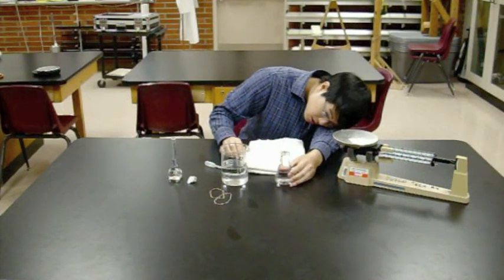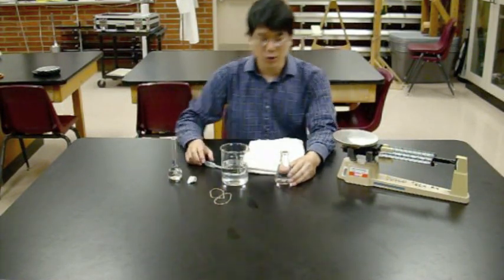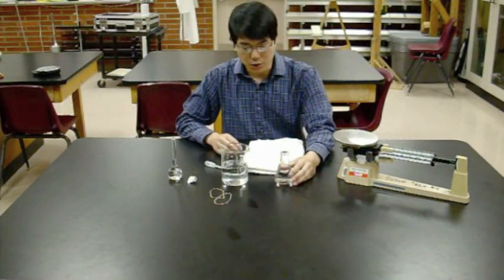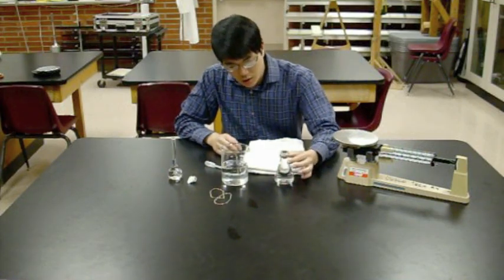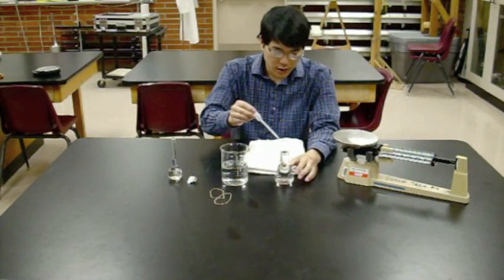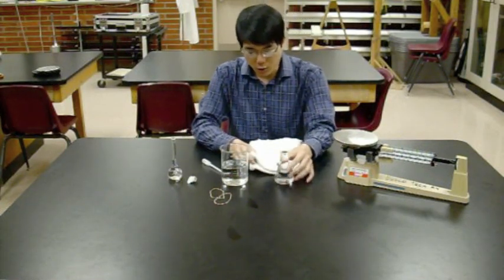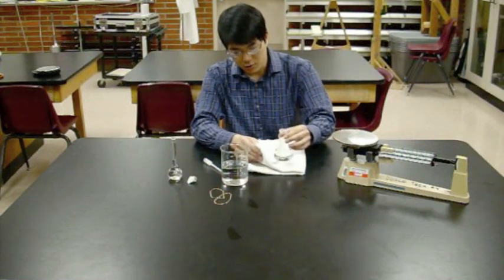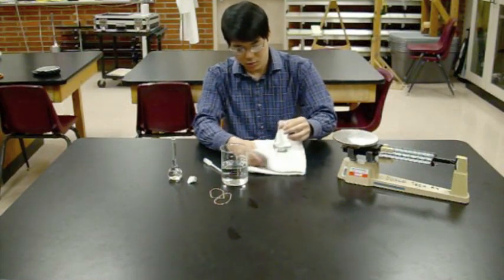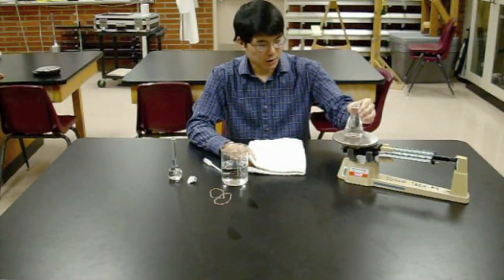That is about as level a surface across the water as we're going to get. If you've got a little bit of an upward meniscus, again, suck off a little bit of water with your pipette. If you've got water on the outside, dry it off with a towel. And then put it back on the scale.